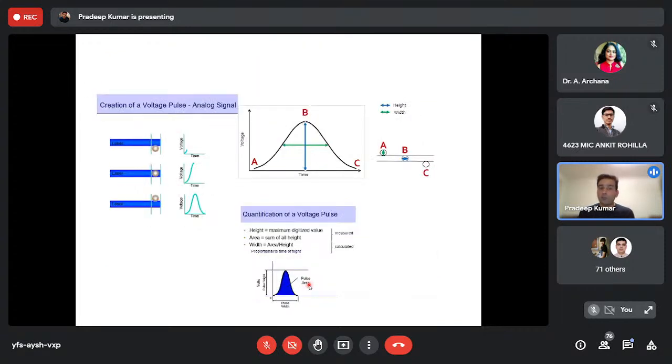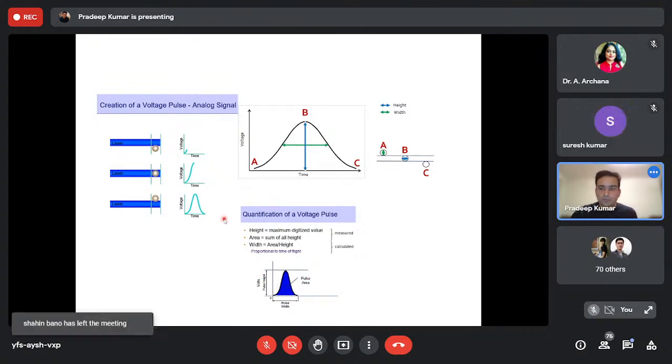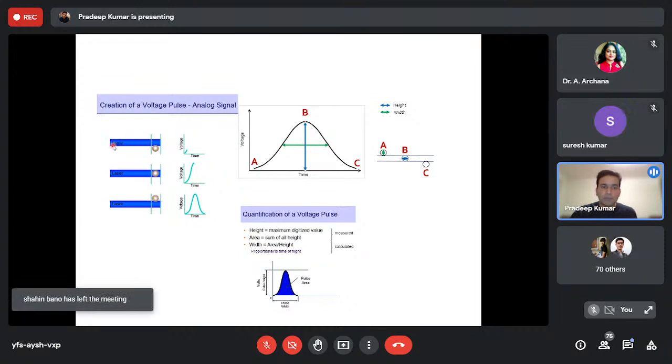Okay. Now, how do you get your signal? I mean, how are these histogram peaks forming? That's happening because the moment the cell enters the laser, some photons are absorbed and some photons are emitted, and you see a voltage peak. The moment the cell is at the center of the laser, there is maximum absorption, maximum emission, and you see maximum signal. When it leaves the laser, absorption is less, emission is less, and that's how you see the voltage peak.